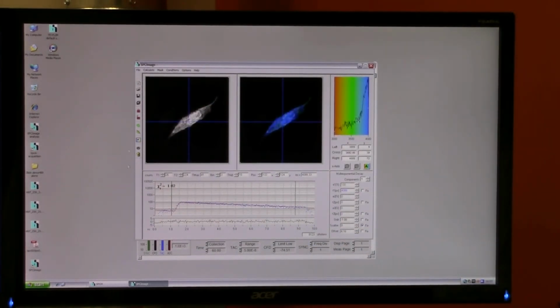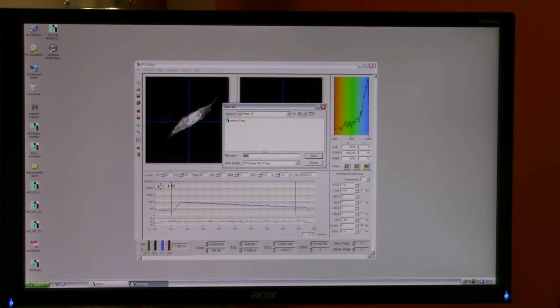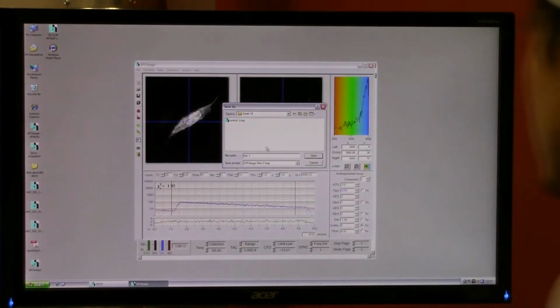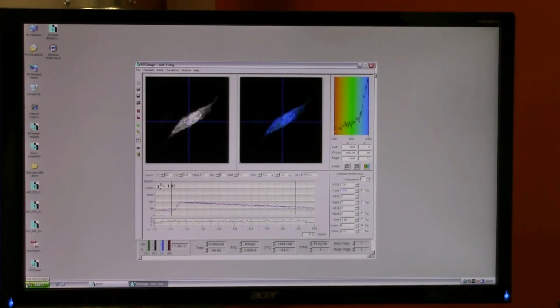And once again, if you actually want to save this particular experiment and be able to come back into the software and adjust range values, then you could do so by pressing File, Save As, and I save this as Test 1, which will correspond to the T1, chi, and photon number values. In a separate module, we'll show you how to actually take these lifetime values and quantify them and generate graphs that could be used in publications.